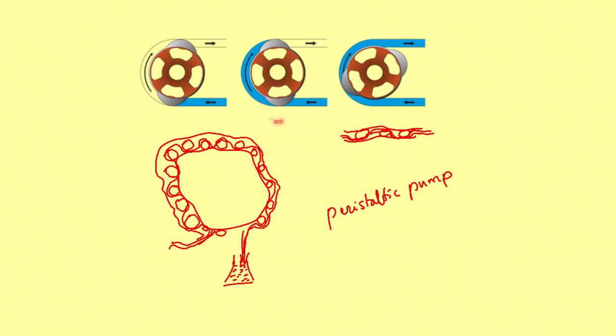If it is acid, then you can use special materials, because rubber and other tubings will not work, because acid will attack the rubber. So, sometimes we use PVC pipes, and sometimes we use Teflon pipes, sometimes we use stainless steel, like that different components are introduced in the pumps.